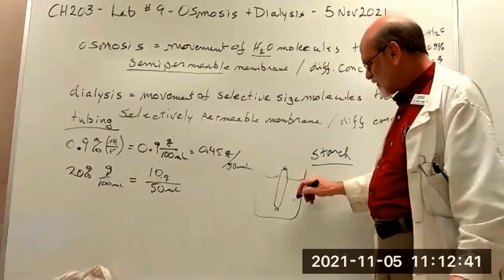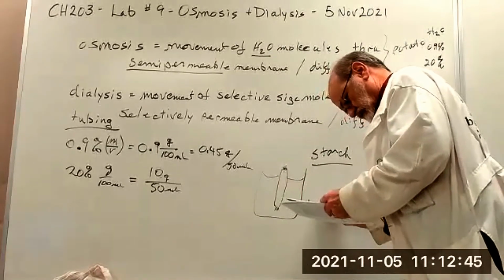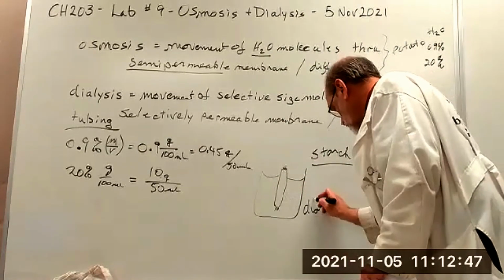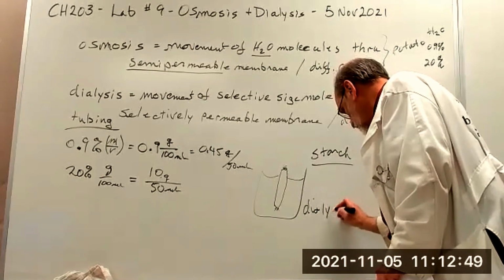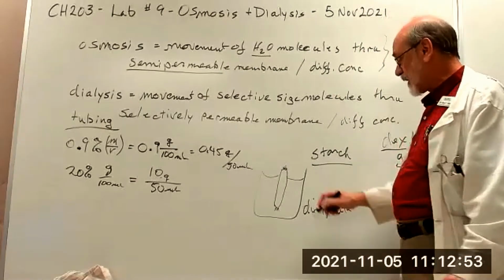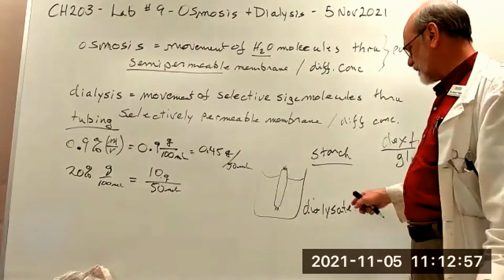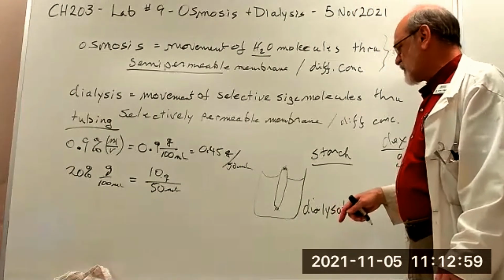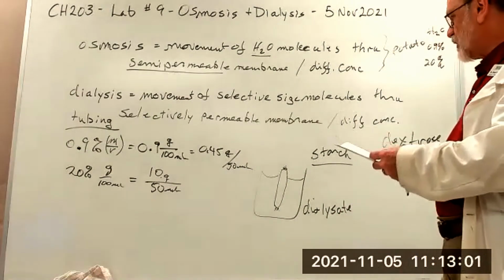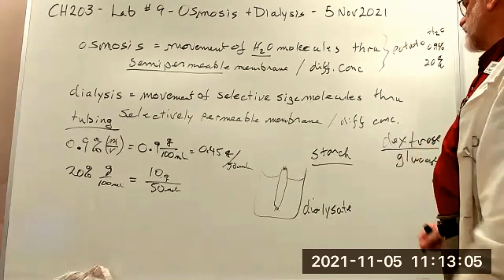This solution outside the tube is called the dialysate. Okay, and in our case, it's pure water. Distilled water.